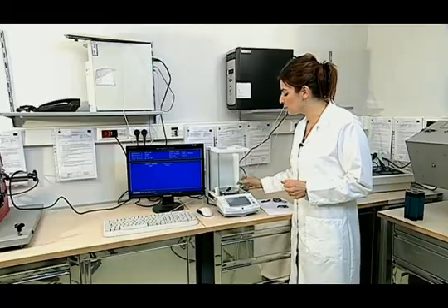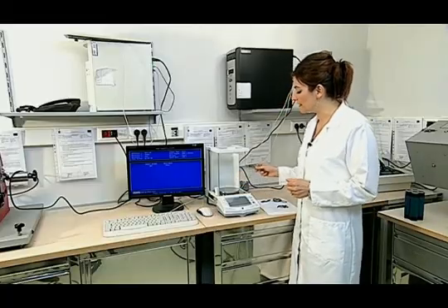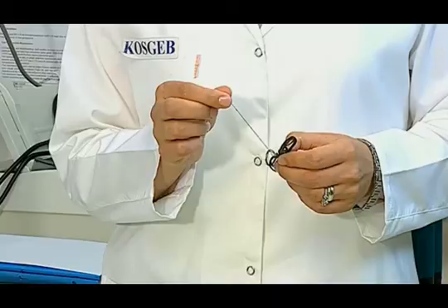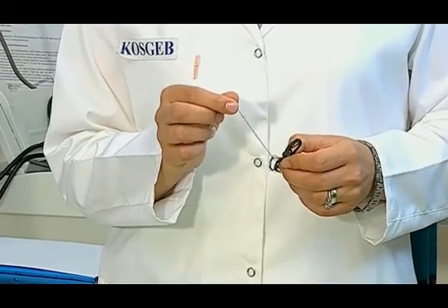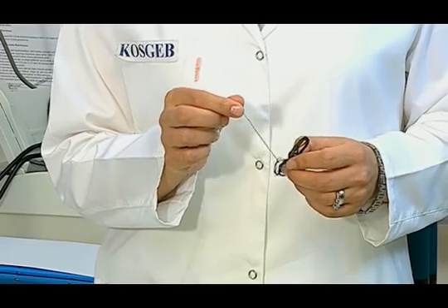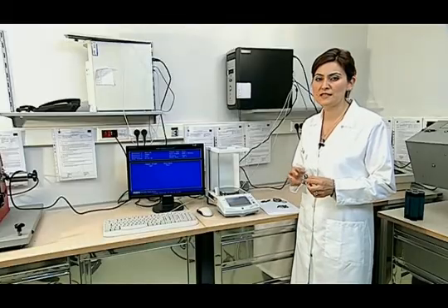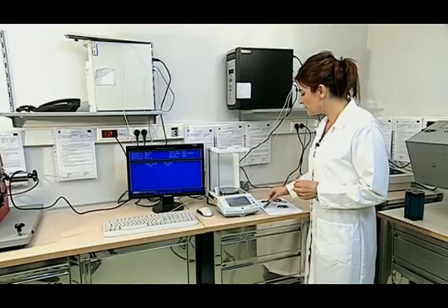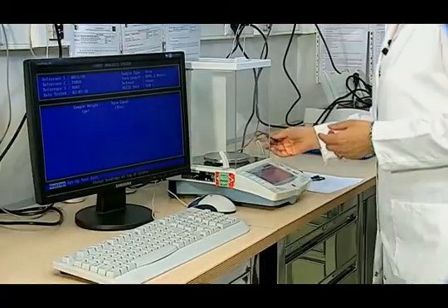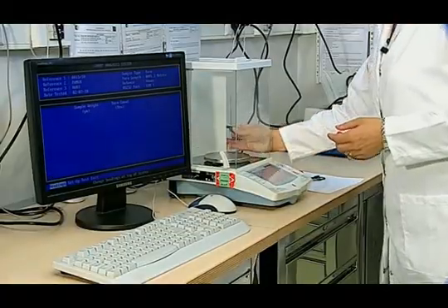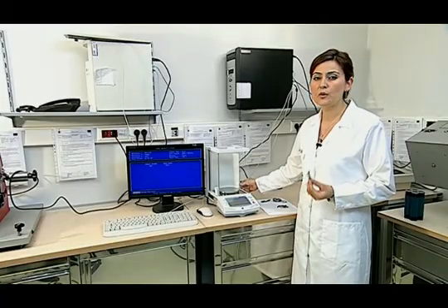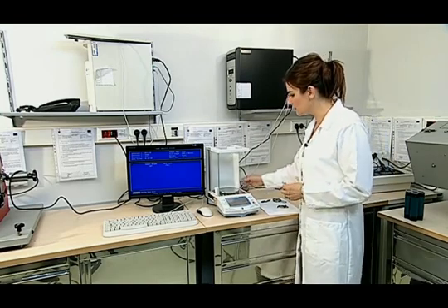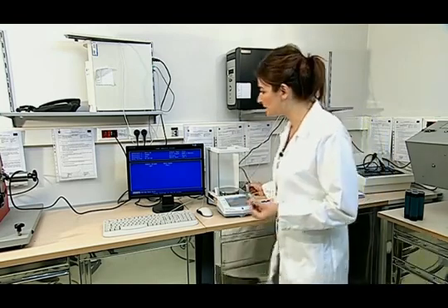Since we use 10 yarns in the sample, a single sample's actual length is multiplied by 10. Then we find the linear density of the yarn in TEX by using the formula. Alternatively, the TEX number can be calculated automatically with the help of recently developed computer programs.